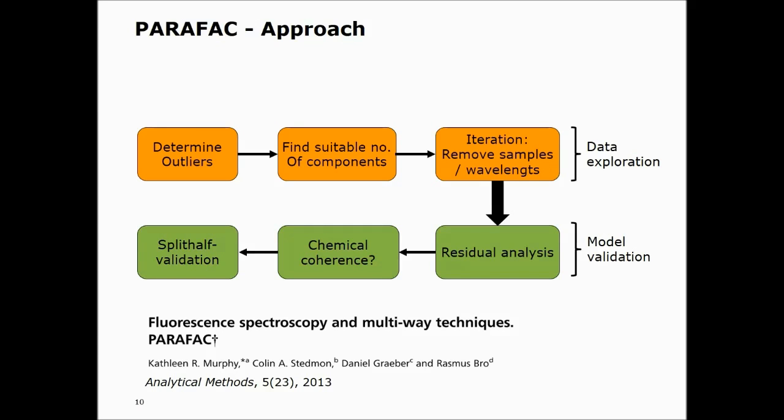If you want a more in-depth tutorial on this ParaFAC modeling, I'll refer you to this paper by Kathleen Murphy, Colin Stedmon, Daniel Graeber, and Rasmus Bro, where they published a paper in Analytical Methods in 2013 that details all of these things that I just said, for you to go and have your own look.